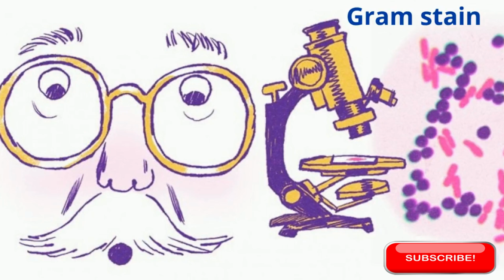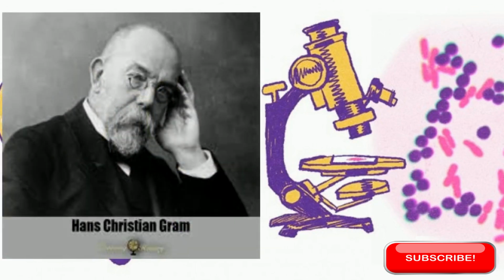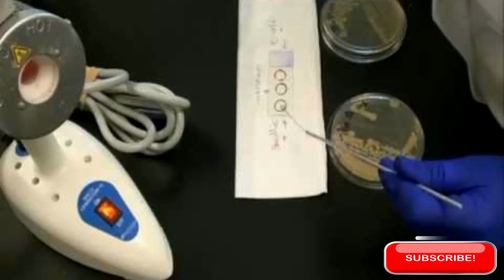Gram staining, or Gram's method, is an empirical method of differentiating bacteria species into 2 large groups based on the chemical and physical properties of their cell walls. The method is named after the inventor, the Danish scientist Hans Christian Gram, who developed the technique in 1884 to discriminate between pneumococci and Klebsiella pneumoniae bacteria. Gram stain is performed on body fluids or biopsy when infection is suspected.